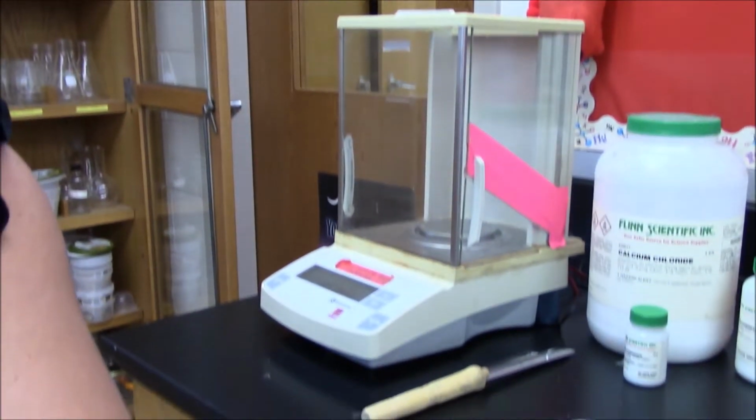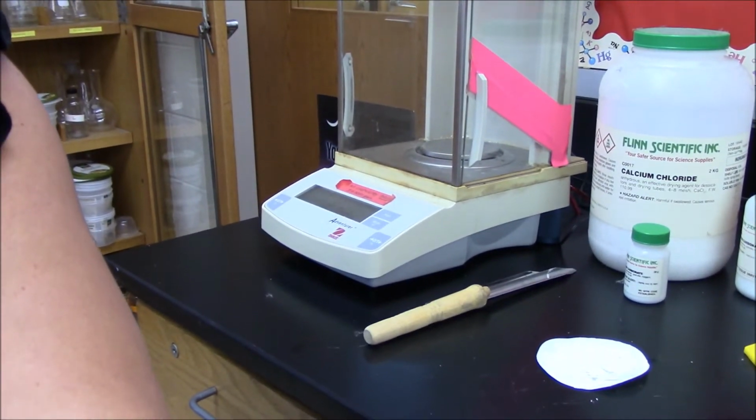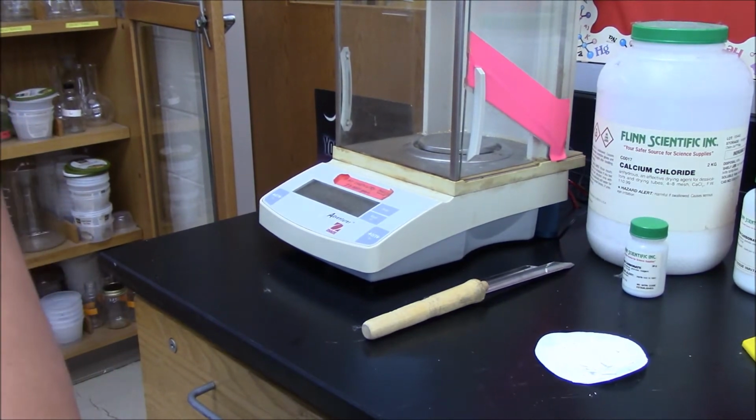Hey guys, I'm back. It's time for us to weigh our dried precipitate. So I'm going to go ahead and show you. Here we go. The dried precipitate.